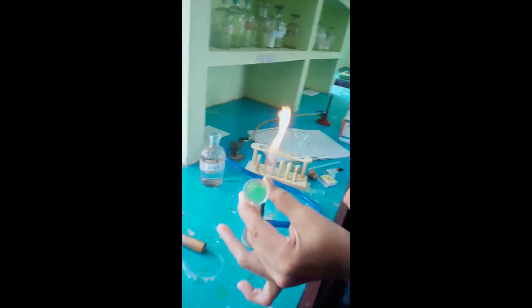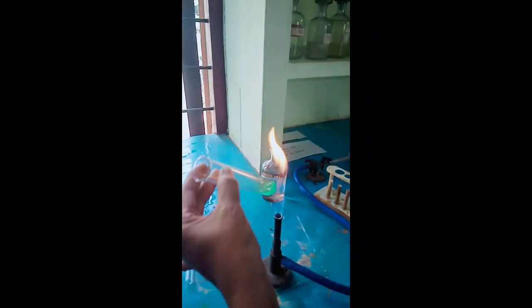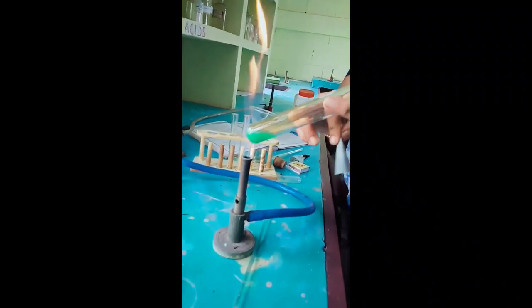Another acidic gas is nitrogen dioxide, which is a colored gas. The color of the gas is reddish brown. So see the evolution of the colored gas. In the test tube you can see a reddish brown gas. Can you see the evolution of the reddish brown gas? This gas is nitrogen dioxide. So the name of the reddish brown gas is nitrogen dioxide.